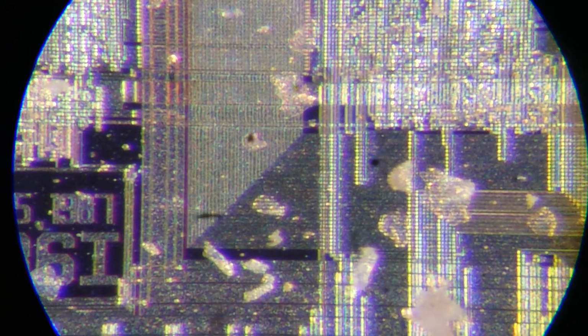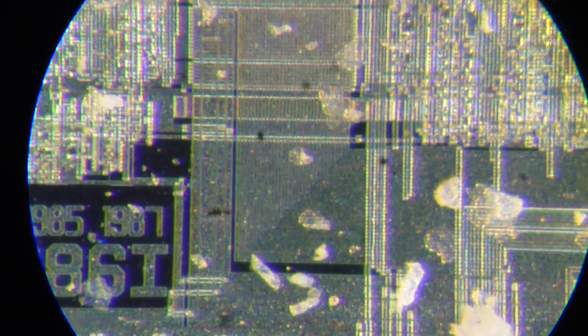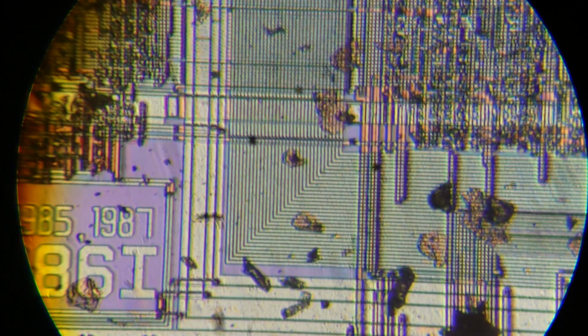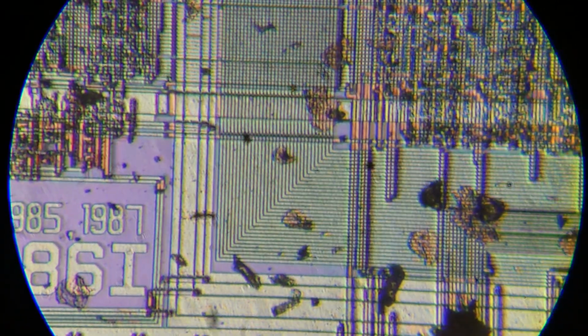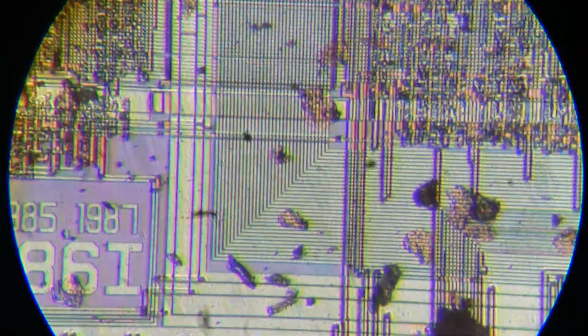And the last thing we can try to do now is to move the light a bit to make light reflecting differently. And with such kind of light we can see some structure at a different angle, and to be frank, we are getting the highest possible resolution here. It looks like light through the lens, but it's not light through the lens. So it's the last thing used to see all those things clearly.